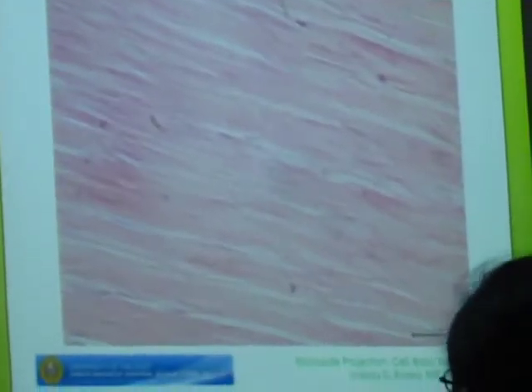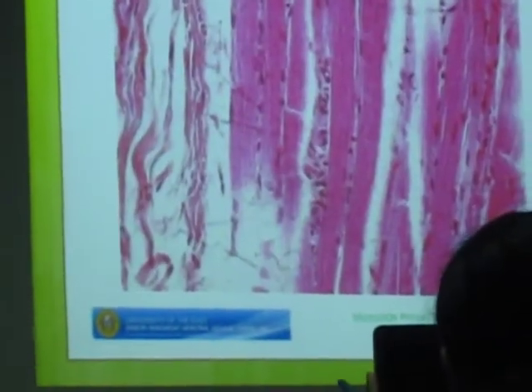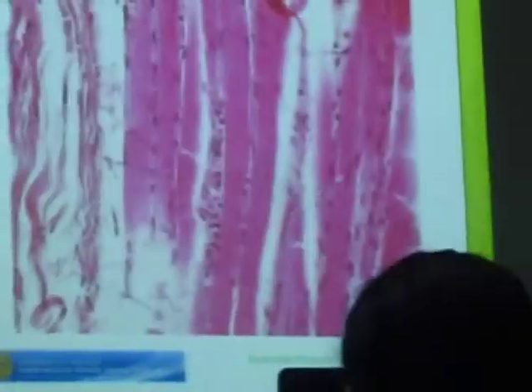Some tissue is easy to identify, some tissue not so easy. That's why practice. Dense, regular. Classify pointed tissue.